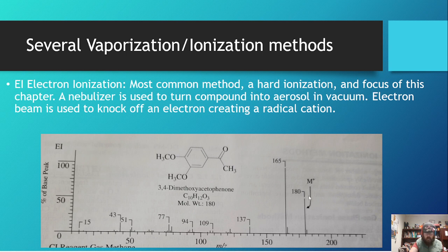And then you could see bigger peaks further downfield over here. I don't know, it's further upfield, I guess. Down this way. But the size of the peaks is just the percent abundance.